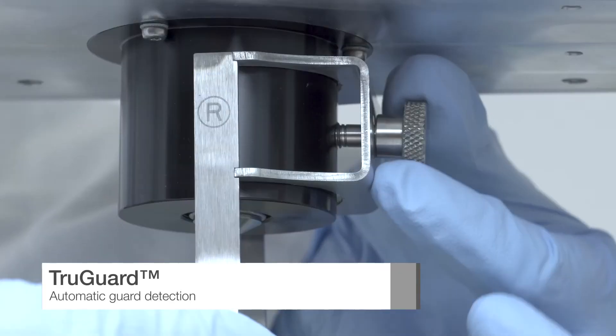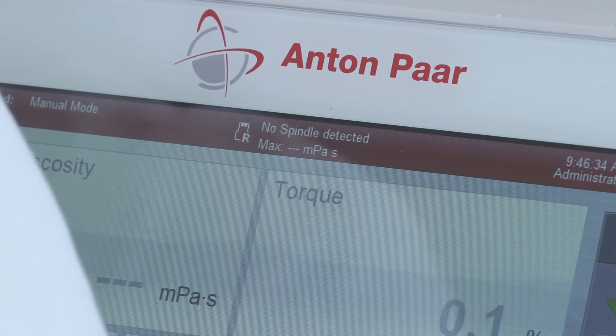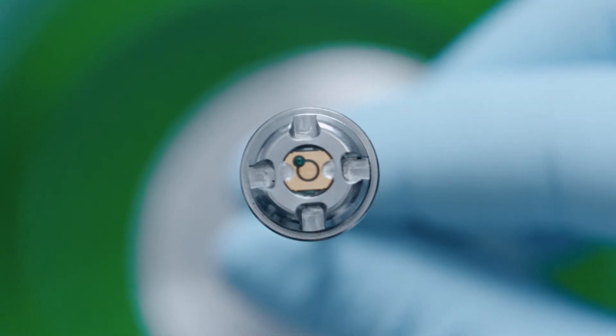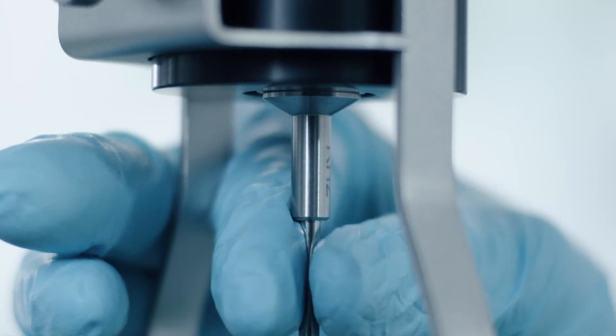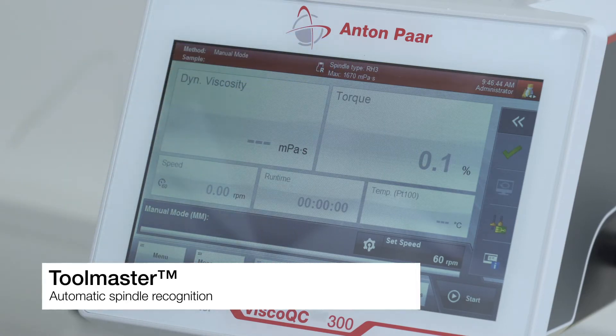With the help of the True Guard feature, Visco QC automatically detects and traces whether a spindle guard is attached or not. Magnetic spindle coupling guarantees easy one-handed spindle attachment. Manual spindle selection errors become a thing of the past, thanks to unrivaled automatic spindle recognition.